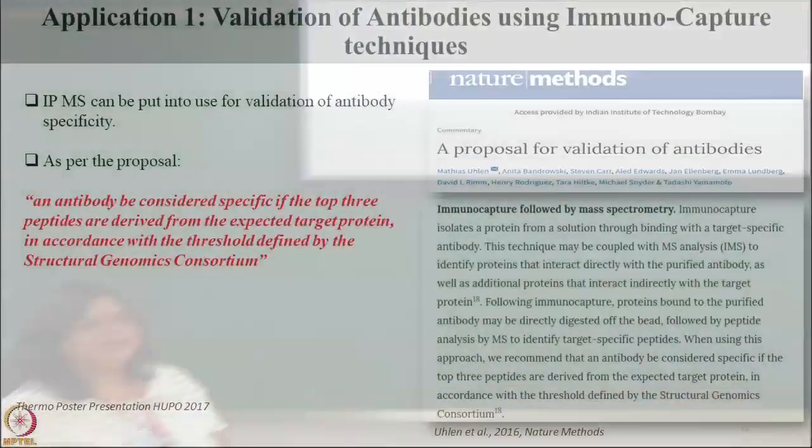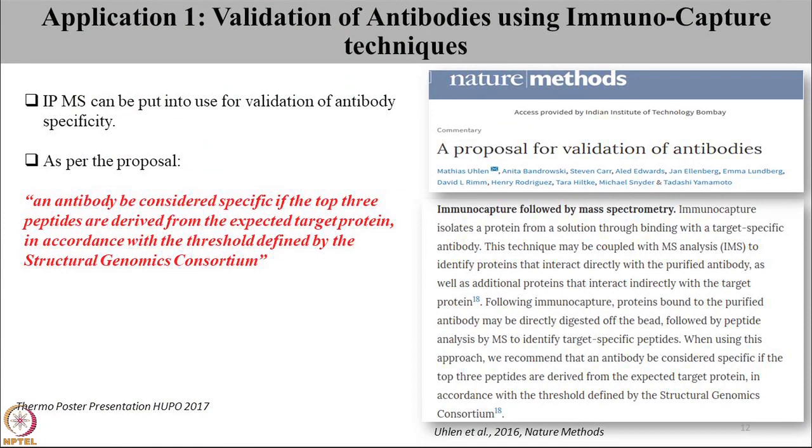In this case, STAT3. If that is coming, you can be confident that whichever antibody is more specific will give a higher number of peptides, or the top hits would be from the protein of interest. In this way, for validating an antibody, they have proposed a panel of many studies, and one of the studies they have proposed is immunocapture.